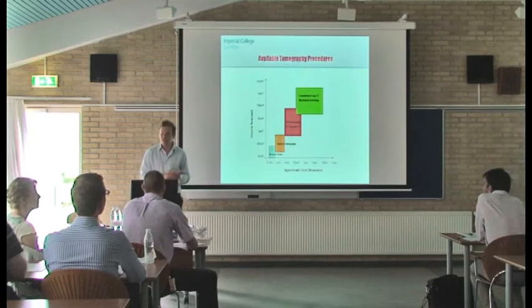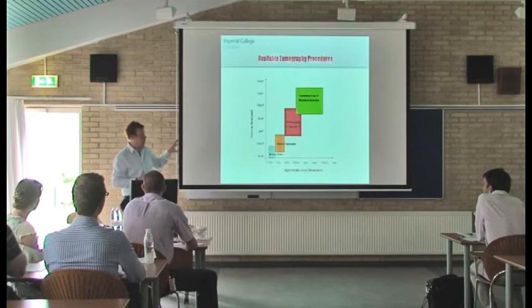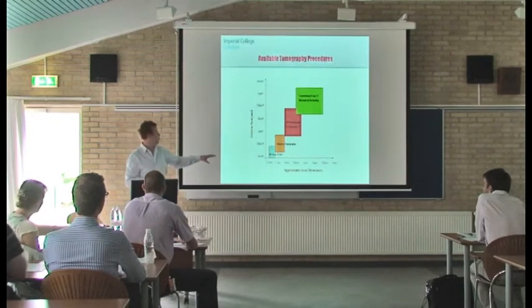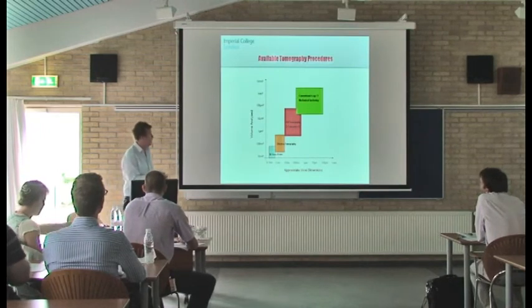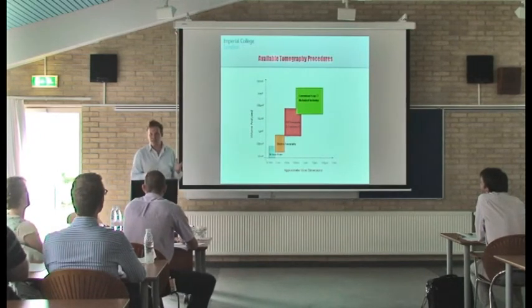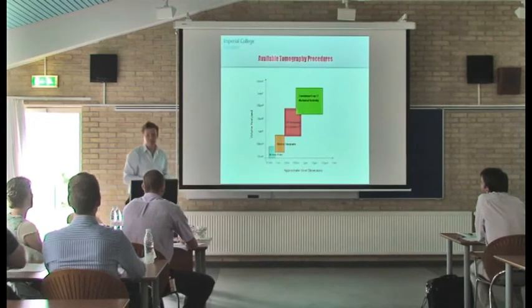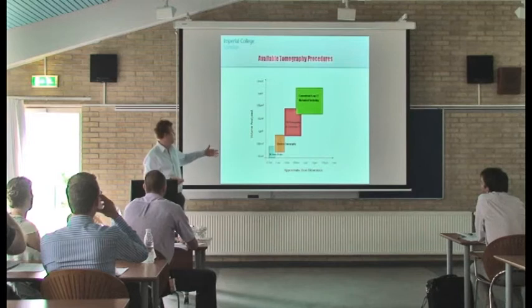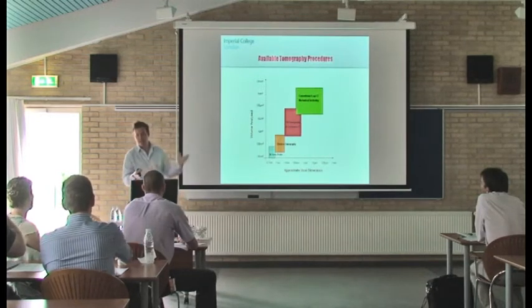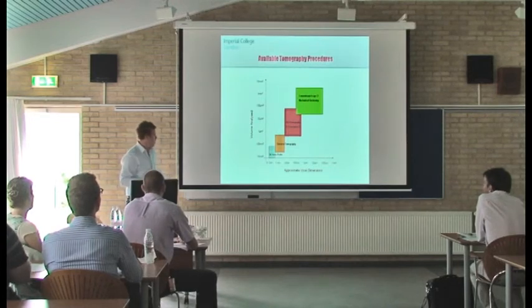So obviously if we define our tomography platform broadly by the voxel dimensions or the spatial resolution we can obtain and the volume we can analyse, then I think most people would agree that to characterise SOFC electrode bulk microstructures, we're really looking around this red area, which is sub-micron voxel sizes and 10 micron cubed plus volumes, to get a representative structure at sufficient resolution.